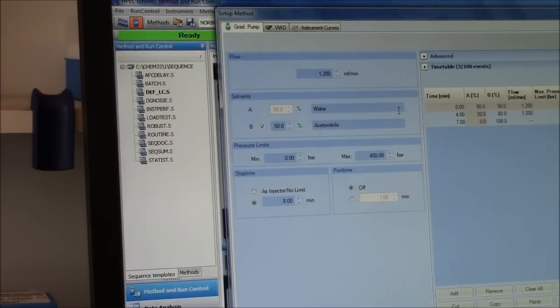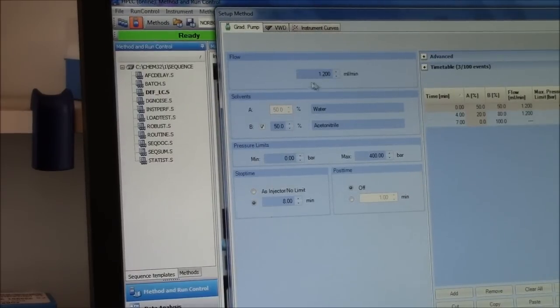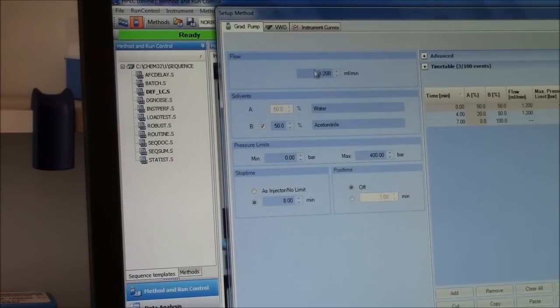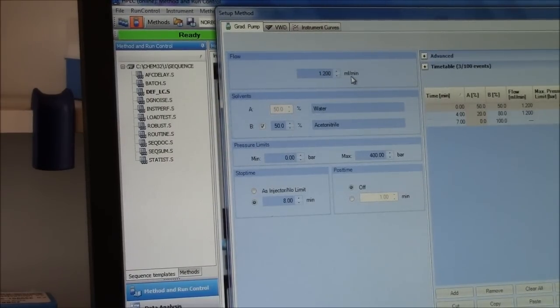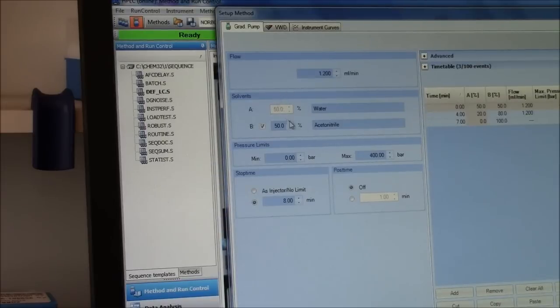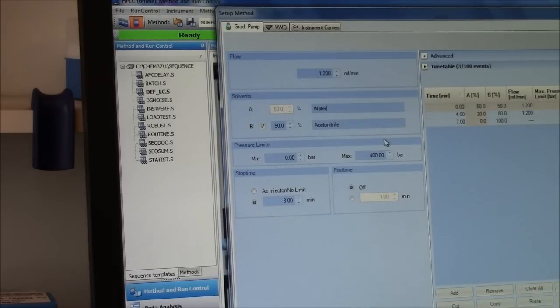Key features of the method. Flow rate needs to be reasonable. I have it at 1.2 milliliters per minute. I am starting with 50% water, 50% acetonitrile.